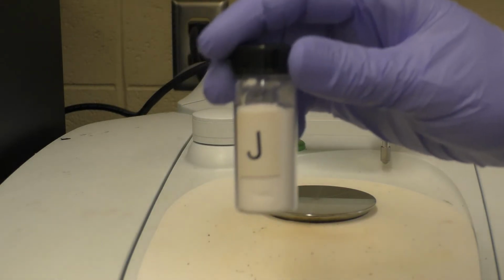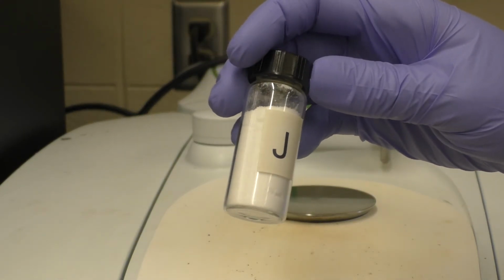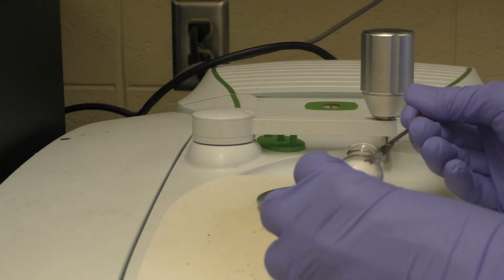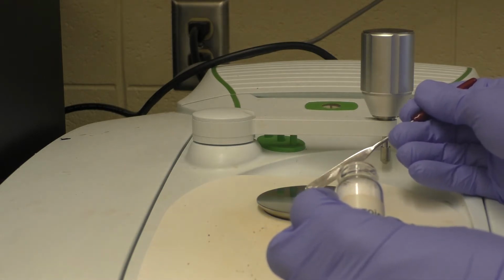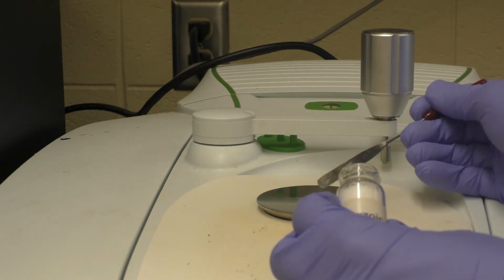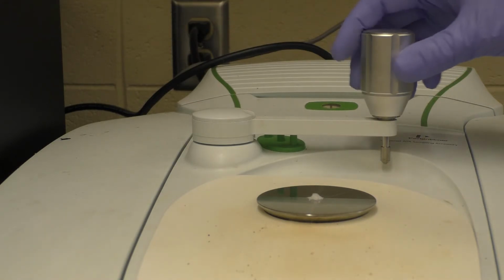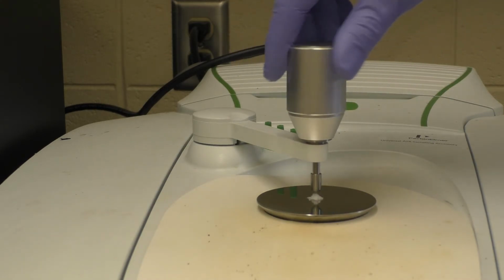Now we'll look at taking the IR spectrum of unknown J, which happens to be a solid, a white solid. So we'll scrape a small pile of the unknown over the hole, the sampling crystal. But this alone will not give us a good IR spectrum because the solid is not in firm contact with the sampling crystal underneath. So what we need is to bring this side arm around and then tighten it down.